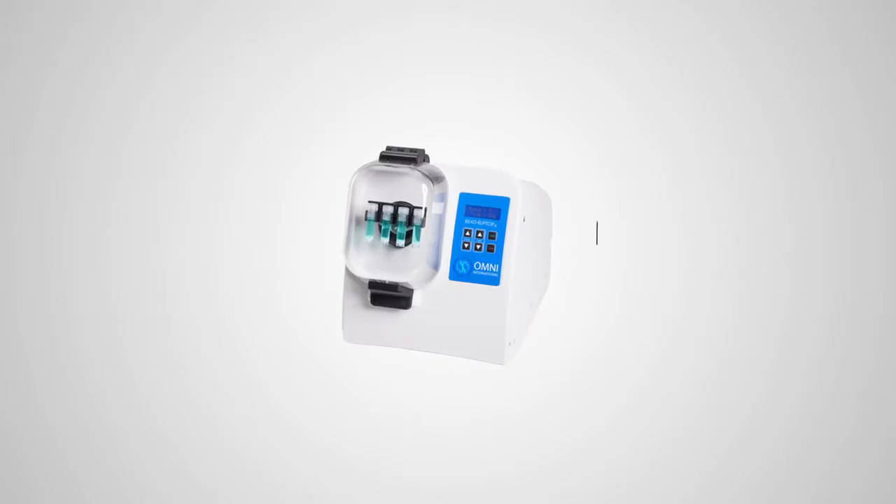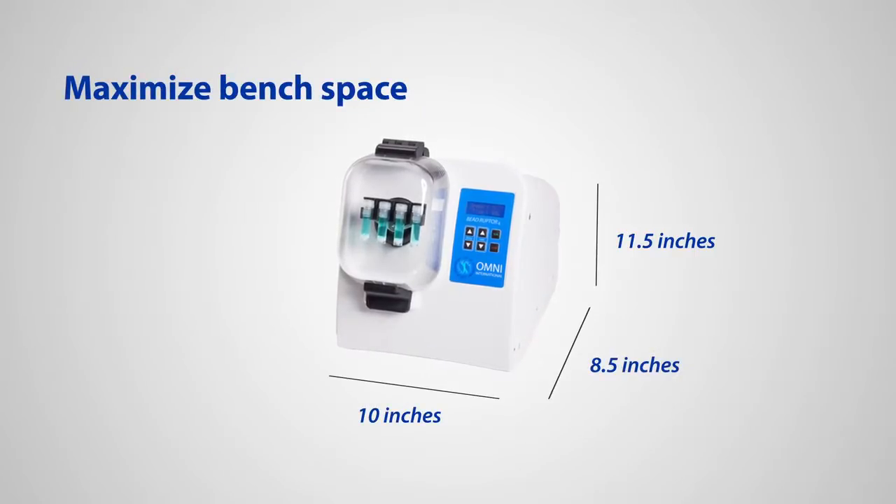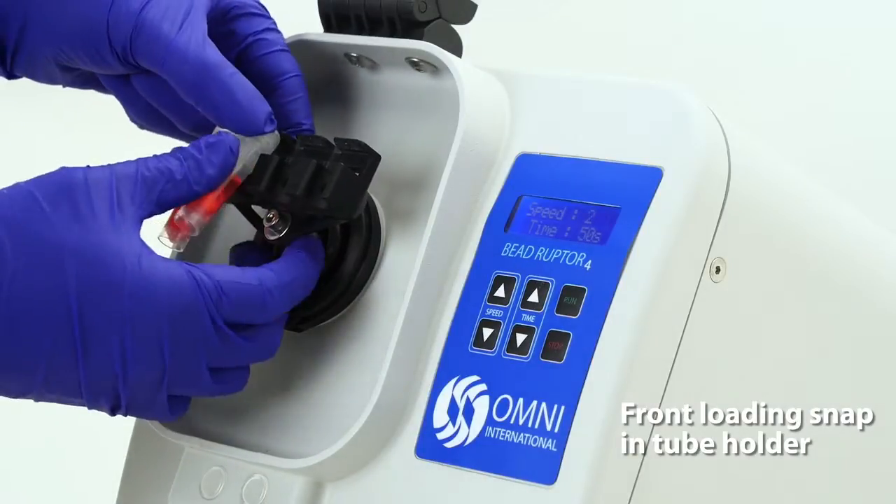The BeadRuptor 4 is designed with a small footprint to maximize bench space. For ease of use, the BeadRuptor 4 has an integrated front-loading snap-in tube holder.